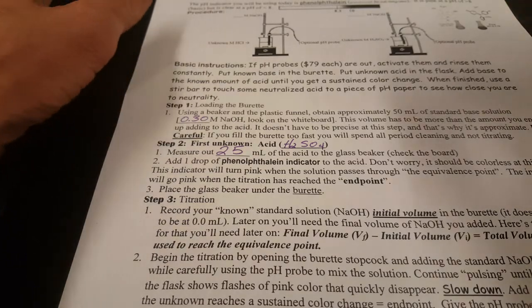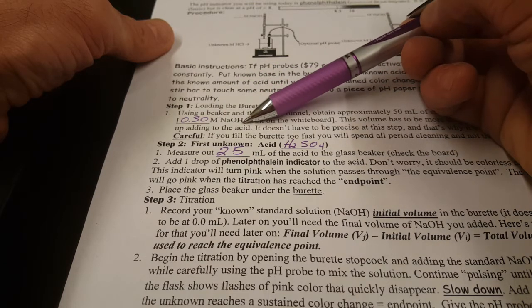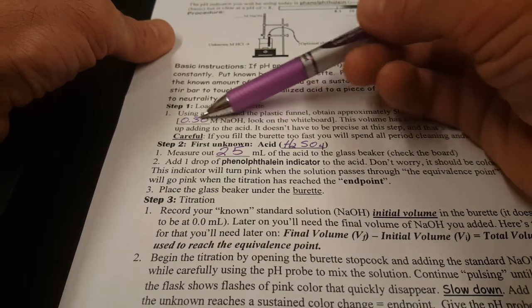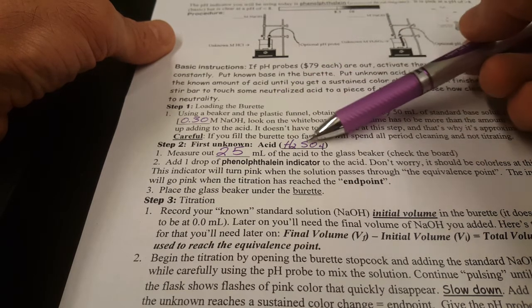Here's the information we have so far. You have put your 0.30 molar sodium hydroxide in your burette to some value that's close to the 0 mark at the top, but it doesn't have to hit it. Don't go above 0 because you can't measure that.